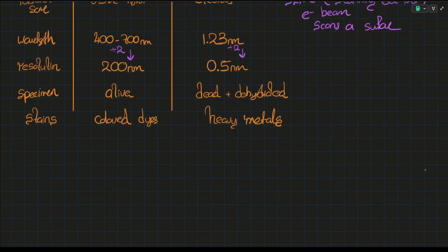Now onwards to specific terms that you have to be aware of. The first term would be magnification, nothing new. How would you define magnification? If it was given to me, this is how I would define magnification.